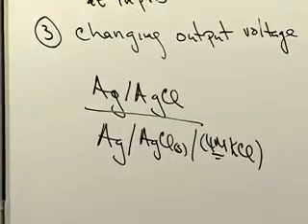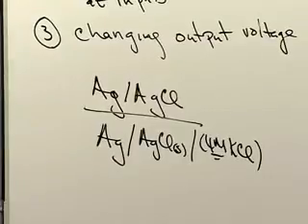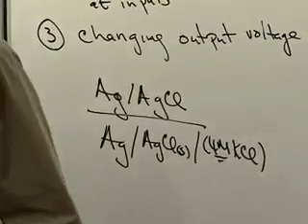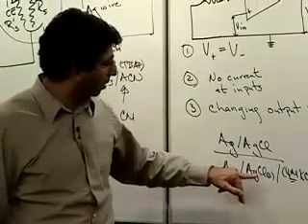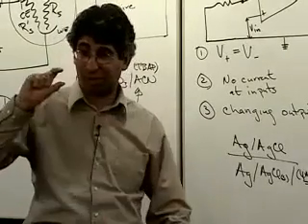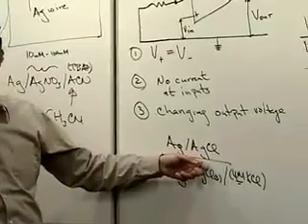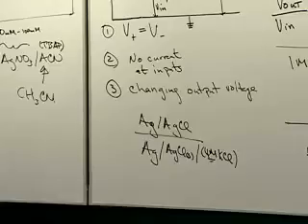I define drift using the open circuit with the SCE. Over what period of time? Minutes. Shouldn't do that. Really, that's how they make them. When they make this, if you look at it, they take silver chloride and pack it into a little glass tube that's open at the bottom, and they shove the silver wire into it. But the way I suggested you do it should actually be a little bit better, in that by electrochemically generating the silver chloride, you get a better silver chloride interface.